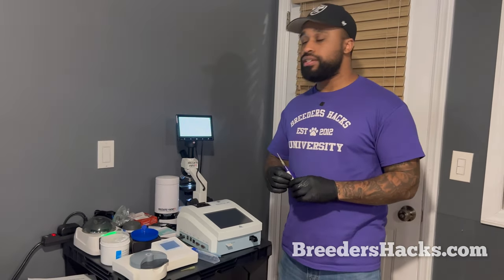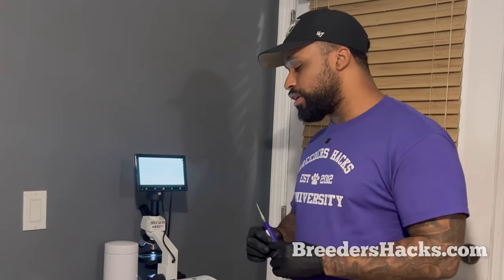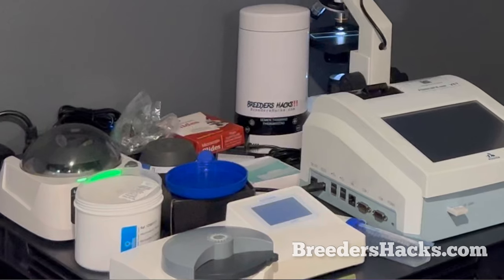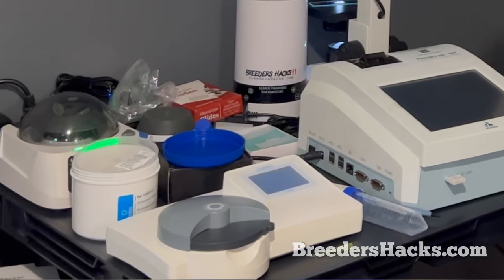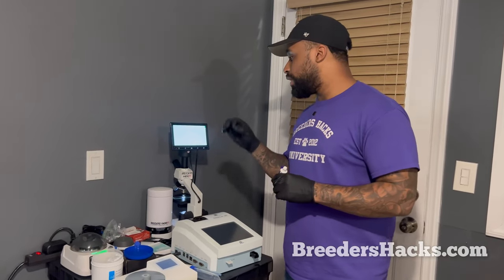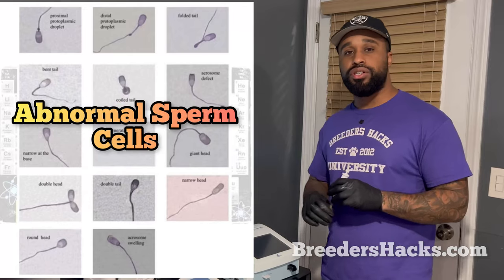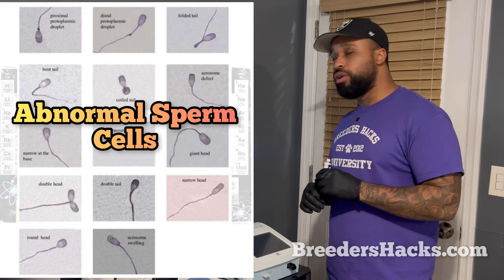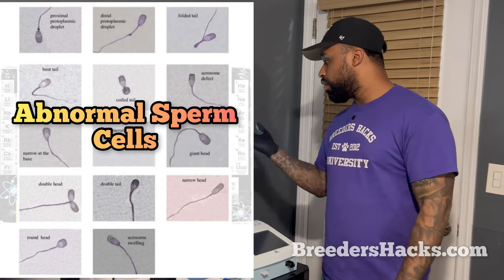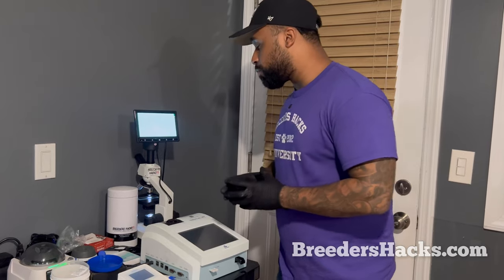So that's how you easily look at what we call the motility, which is the movement of the sperm cells. Then there's sperm count, and the last thing that you can do, that I have videos showing how to do, is the morphology. We can actually kill off some of the semen so that it's not moving, and zoom in and look at the structure of the sperm cells, to see if they're morphologically, meaning the shape, normal, and if the dog has produced good looking sperm cells.